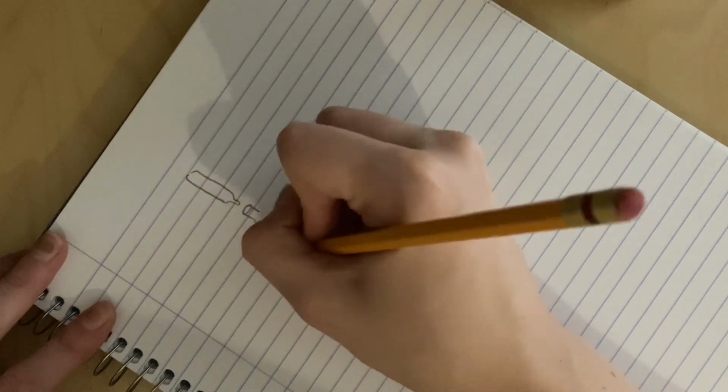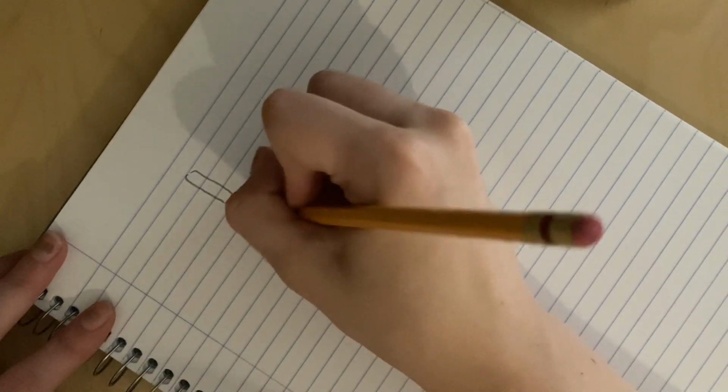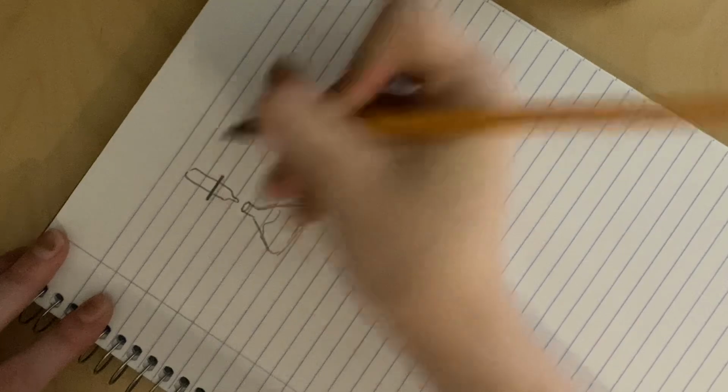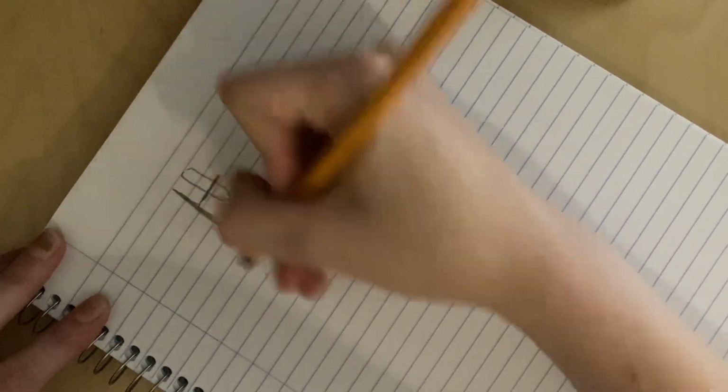That's pretty important. You need to have the steps of titration memorized. You need to have concentration and so on. So a clamp, you've got the stand, ignore this ugly drawing. Okay, you've got this set up.